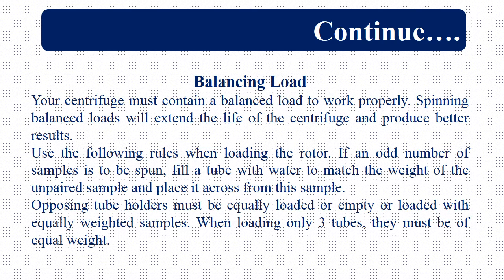We have to follow some rules when we are talking about the loading of the rotor. If we have an odd number of samples in the centrifuge, means limited quantity of solution is available, then in that situation, how to balance the centrifuge rotor test tube holders? One test tube will be placed in the holders which will have the solution for centrifuge. In alternative places, we will put water in the test tube. There will not be any solution, but the rotor will be in balanced stage.